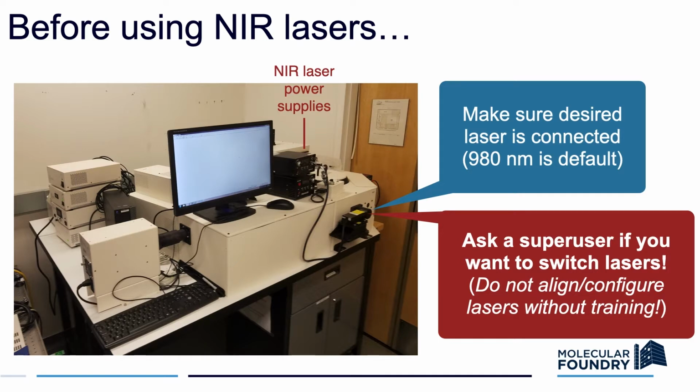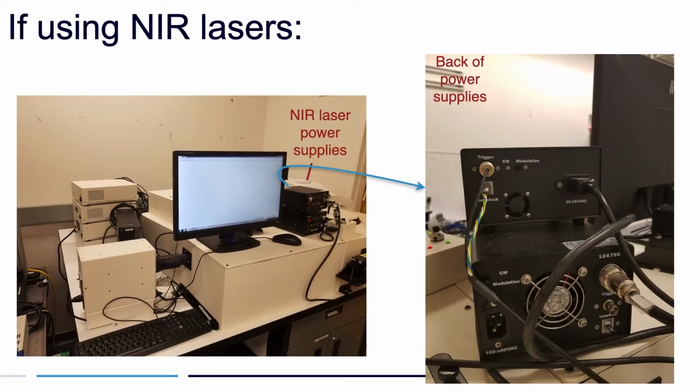These are high-powered lasers that have many different safety requirements. Only super users with the appropriate laser safety training are allowed to reconfigure and align lasers. Eye exposure to class 4 lasers is a major safety hazard. Bypassing these safety protocols can result in removal of instrument privileges.